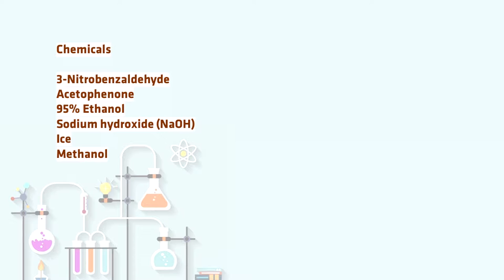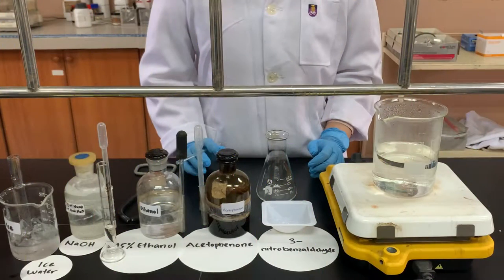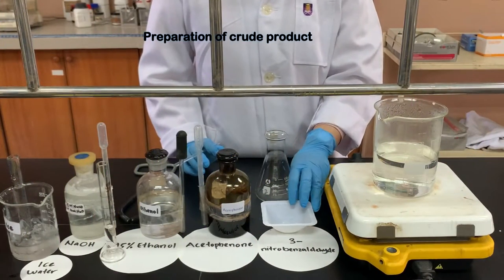The chemicals: 3-nitrobenzaldehyde, acetophenone, 95% ethanol, sodium hydroxide, ice and methanol. The procedure: first of all, the preparation of crude product.